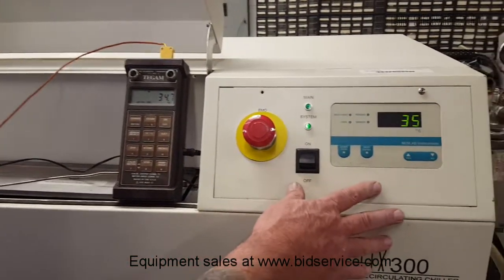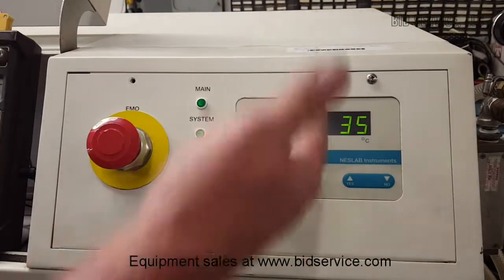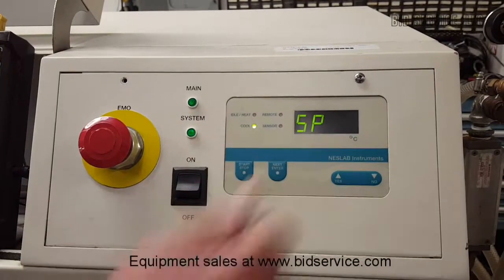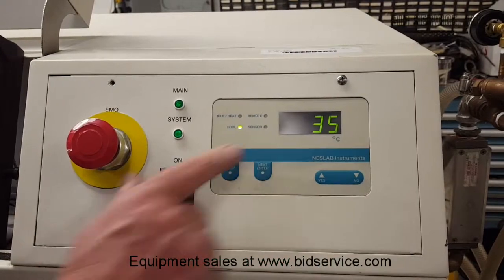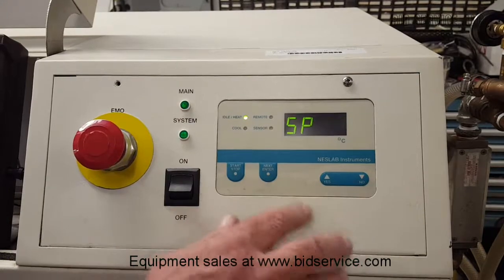To change your temperature, once you have started and it is running, hit the next or enter and SP and 35 — that is your set point. I am going to change that. You can see right now it is cycling cool, so it is trying to maintain temperature.